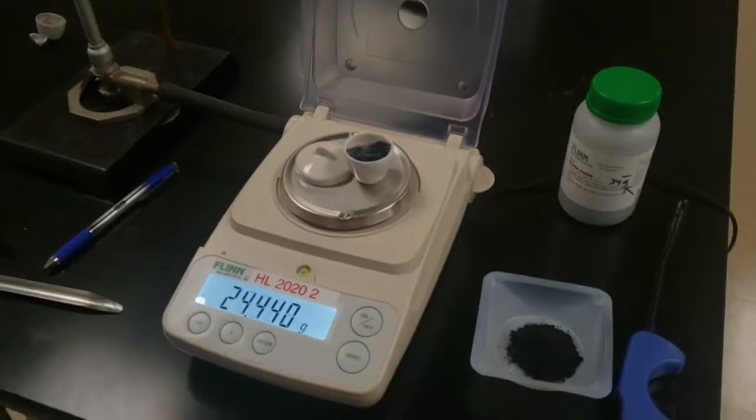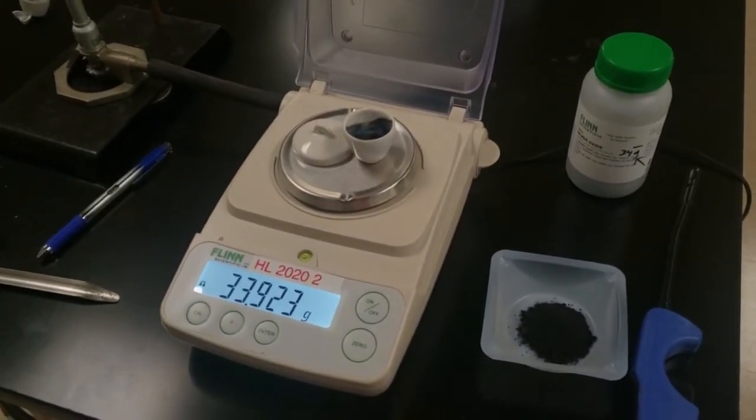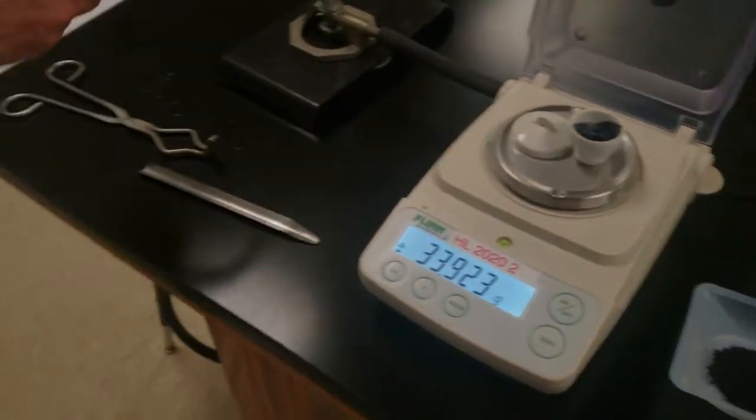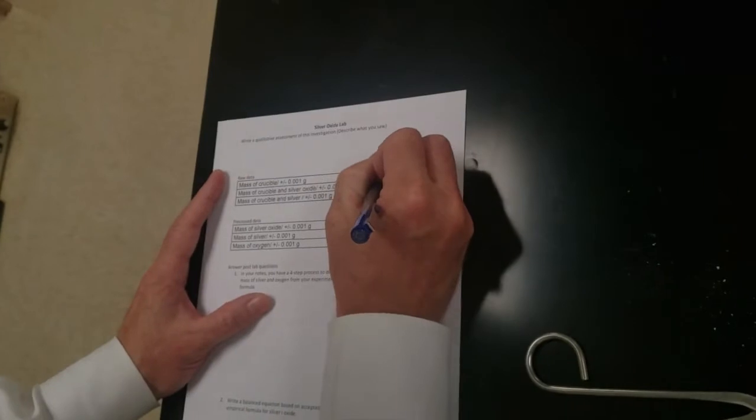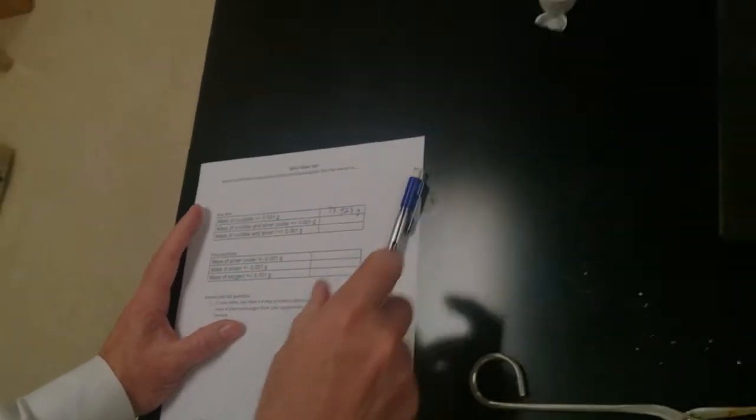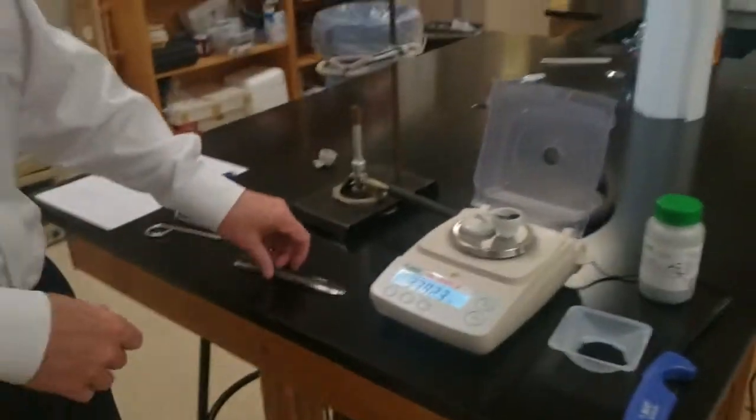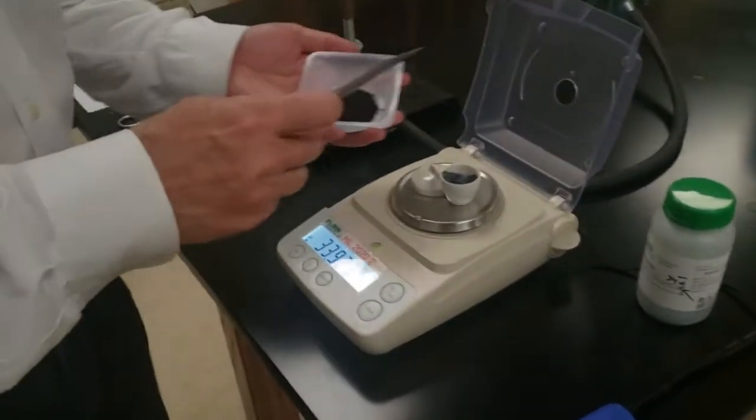So we're going to weigh it to the thousandth of a gram. That last number may flicker. Just let it stop moving around, and if it keeps flickering, just try to pick the middle one. Write down the mass of the crucible with the lid.